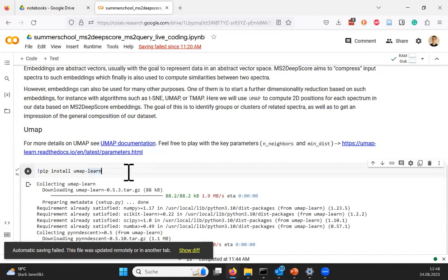There's a number of tools that are meant for what in data science we would call dimensionality reduction. We have seen other tools like this. A fairly common one is PCA. If you have something with a lot of numbers, like a vector with 200 or 500 numbers, you cannot visualize it at all. So what people often do is try to compress it, accepting that we lose information, down to 2 or 3 entities, because then you can make a plot where every data point has a position. You can use PCA for it. It's a linear technique. It's not great for all things, but for some it works really well.